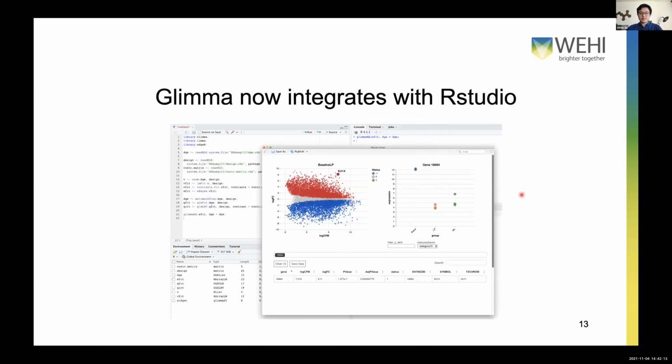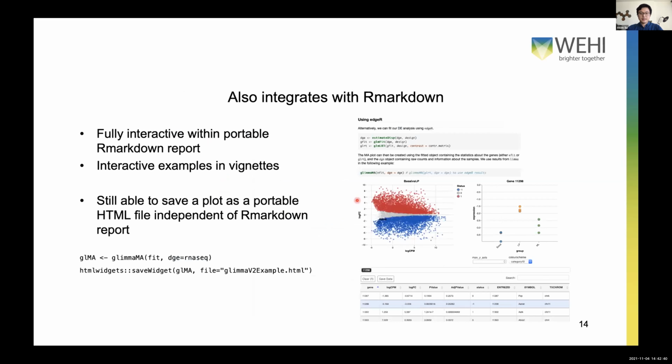With the new Vega functionality and HTML widgets, all of this now integrates very well with RStudio. Previously, this would pop out a web page in whatever default web browser you had. Now it just pops out in the RStudio viewer, which is one less program required to view these. And it all works as I showed before.